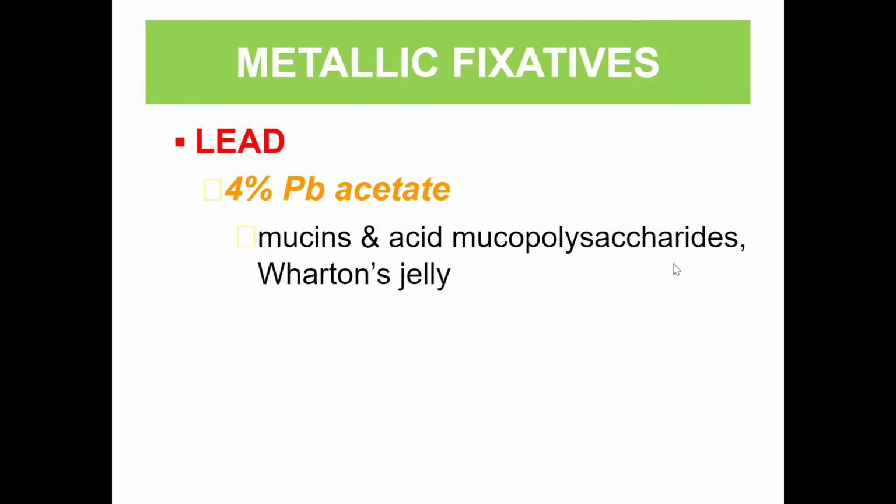For your lead, the usual concentration is 4% lead acetate, used for your mucin, acid polysaccharides, and your Wharton's jelly.